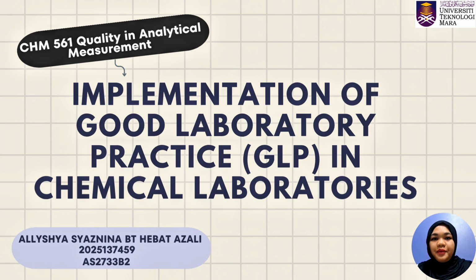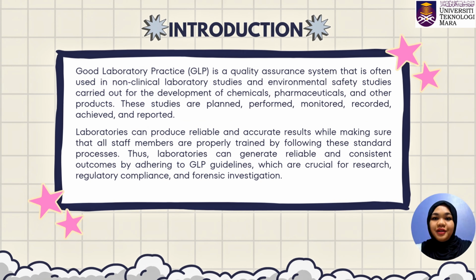In this video, I'm going to explain about the implementation of Good Laboratory Practice, GLP, in chemical laboratories. First, we go to the introduction.